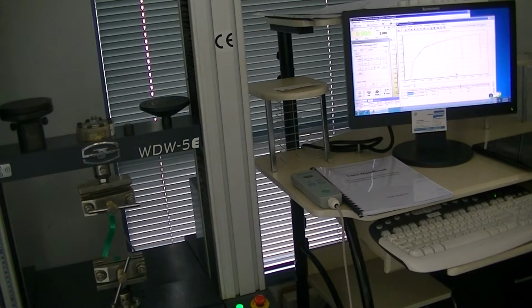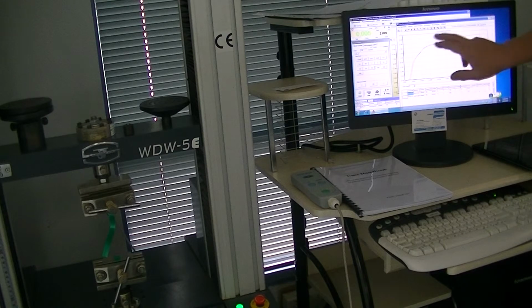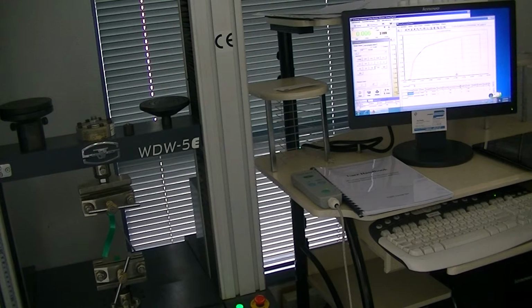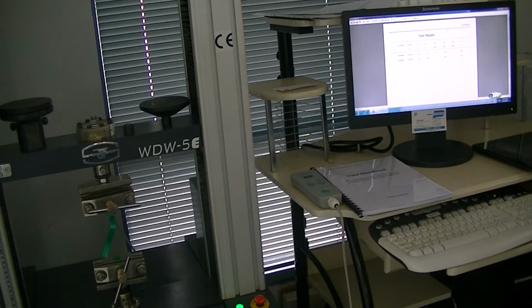The next slide, slide number 14, says screen now has all 5 curves. In the slide presentation we did 5 graphs. In this case we're only doing 2 just to save a little bit of time. So we've gone over the graph, and you can see the 2 graphs, and you can see the sample, you can see the results, everything on the one screen. We go to slide number 15. Right, click F report, which is up here, F report. Then it says, then click batch report print. Batch report print is here, and we can print.